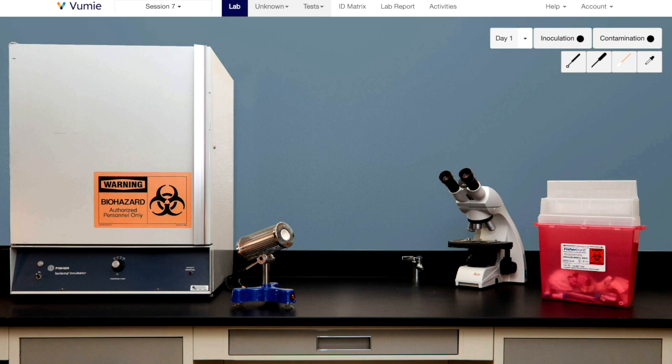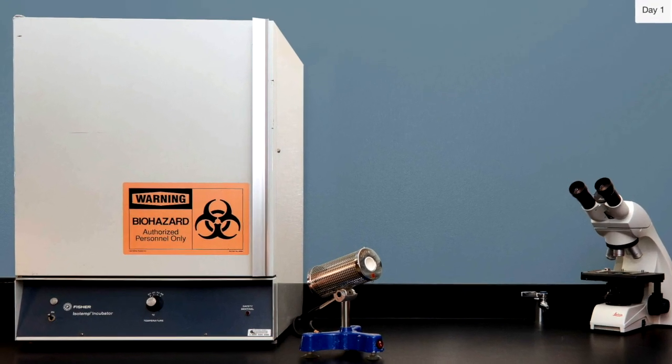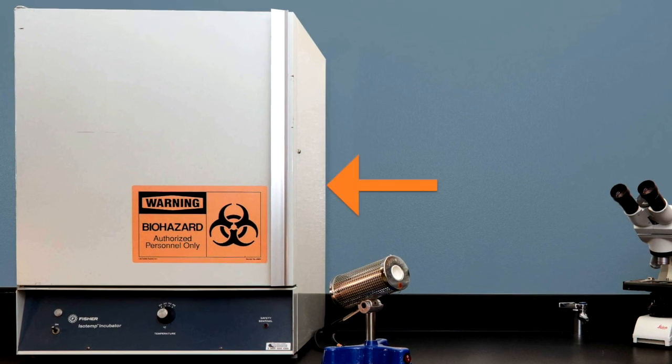When you log in, you will find the virtual lab is a pretty simple place to work. At the left is an incubator set to 37 degrees Celsius, optimal growth temperature for the microbes you will use.